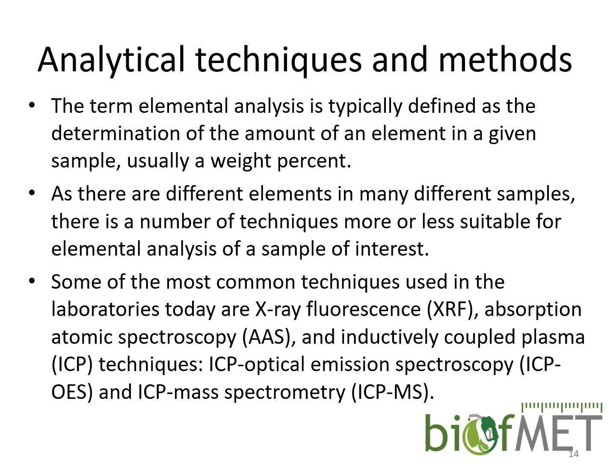Elemental analysis usually refers to the concentration or the amount of an element present in the sample. It can be weight percent, as it's written here. It can be volume percent, depending on the aggregate state of the sample. It can be molar percent or molar concentration, and so on. Whatever is the most suitable way of representing results for a particular analysis. There are, of course, many different elements and many different samples, and they appear in different concentrations.